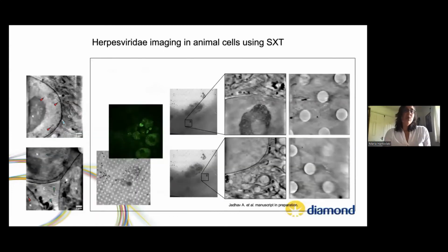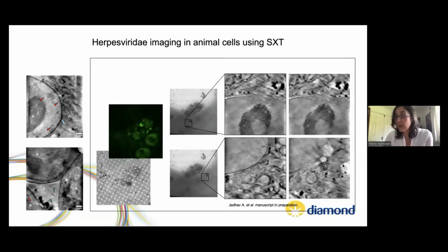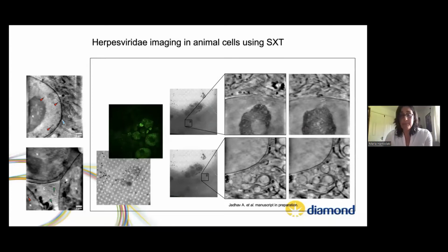And I chose one of our projects at the Beamline because one of the major directions of my research is herpes viruses. So this is imaging in animal cells. We were looking at chicken cells with an animal institute here, and we were tracking the progress of Marek's disease virus inside the nucleus as well as outside in the cytoplasm and the tunneling it produces. We were able to collect lots of wonderful data on different variants. Most of the strains that we look at in this case were vaccine strains, so they're very important commercially.